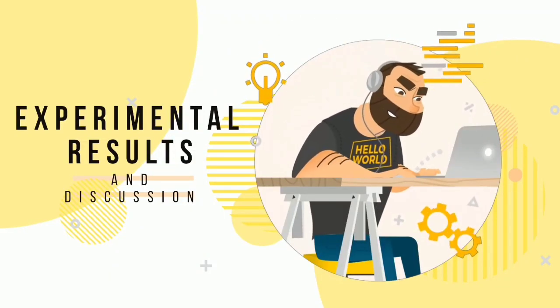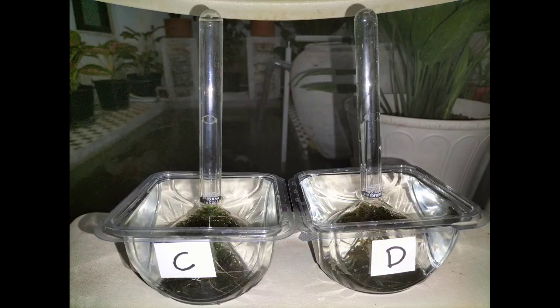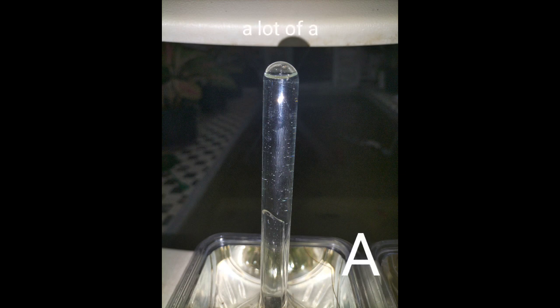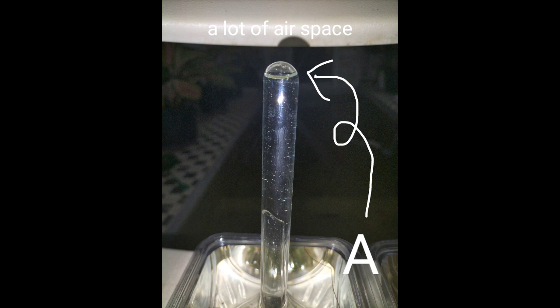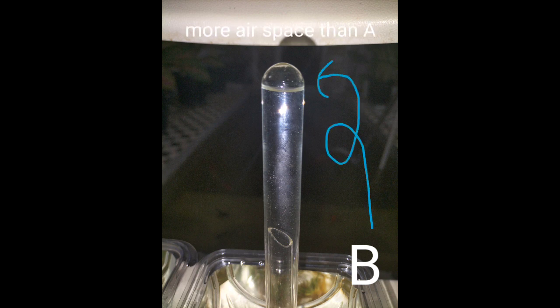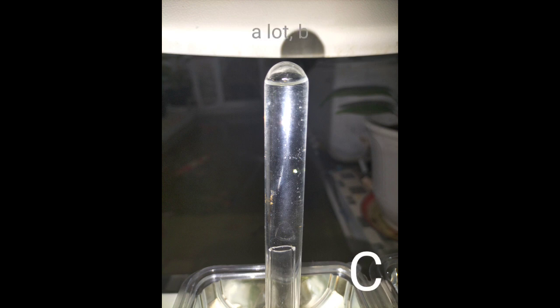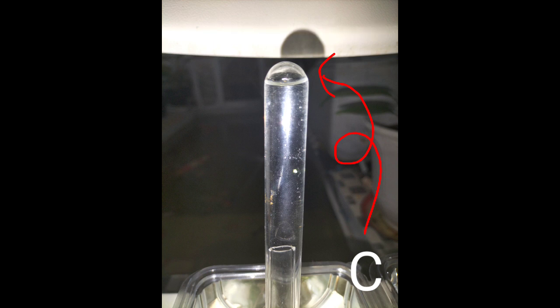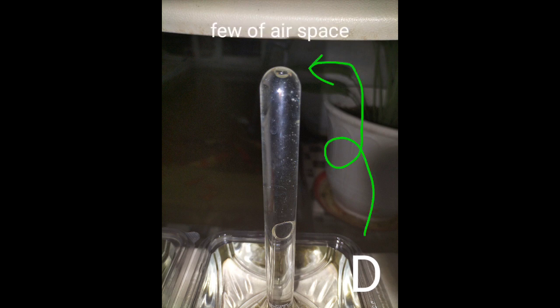Experimental results and discussion: After 3 hours of observing, we look at the tip of each test tube. Test tube A in the white room as control has a lot of air space. Test tube B in the blue room has much more air space than test tube A. Test tube C in the red room has a lot of air space but not as much as test tube B. Test tube D in the green room has a few air spaces.